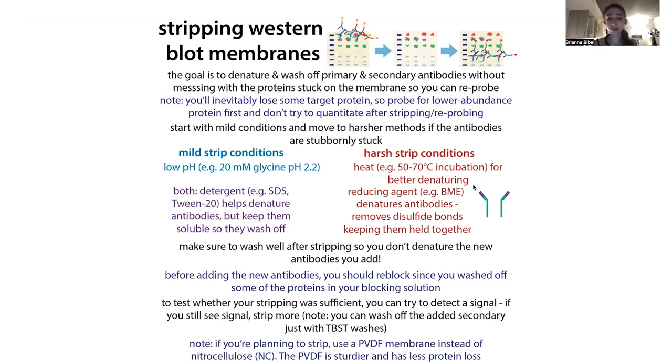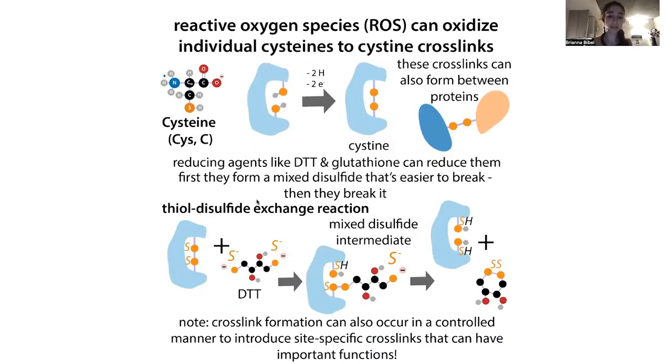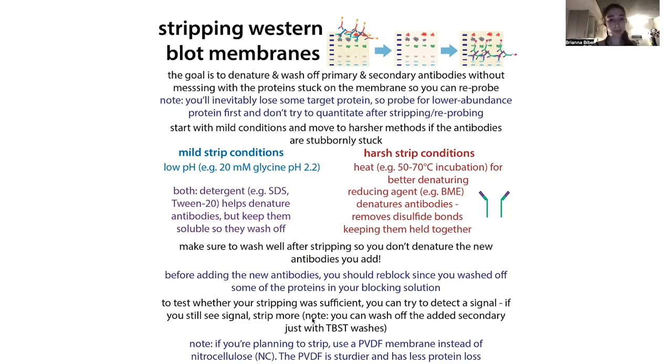And often you're doing this in the hood because it has BME, beta-mercaptoethanol, which is a reducing agent. Basically, what it can do is help break up the antibodies, because these antibodies have multiple chains that are held together through disulfide bonds, so these cysteine crosslinks. BME is able to break up those crosslinks and therefore get the antibodies to fall apart, the chains to come apart.